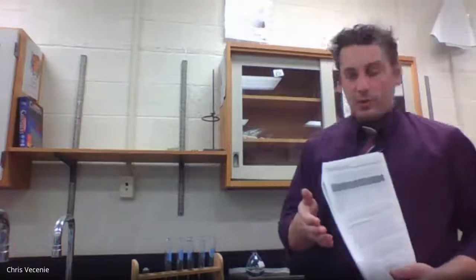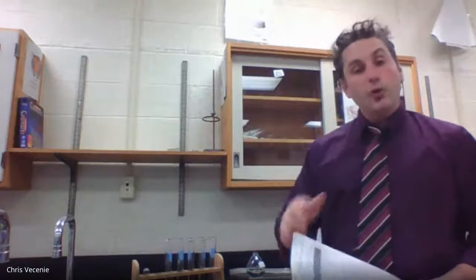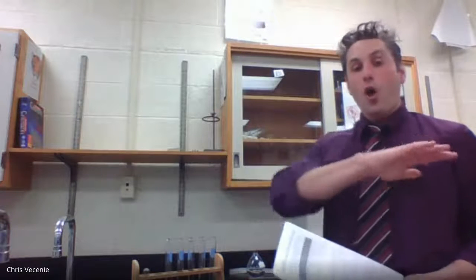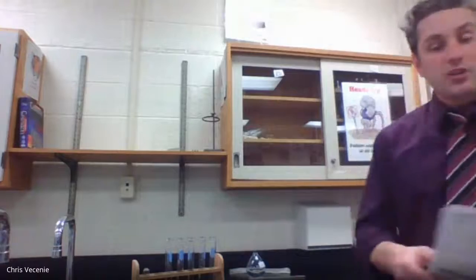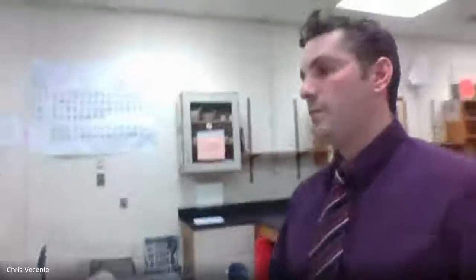All right, so we would prep those exactly like I just showed you with these guys. So I'm not going to walk you through that. I can simply tell you what our absorbances were from that, but you would have just done the same exact thing. You go get a beaker, transfer it, fill up each one, then get the second substance, fill up each one, fill up each one with the distilled water. Notice again, constant volume of 10 milliliters. So your V2 for your dilution problems, your M1V1 equals M2V2, that's going to be 10 milliliters all day long for everything. Put all those in. You're going to notice they're not quite as dark this time. But now I'm going to give you what those values are to fill in that table.